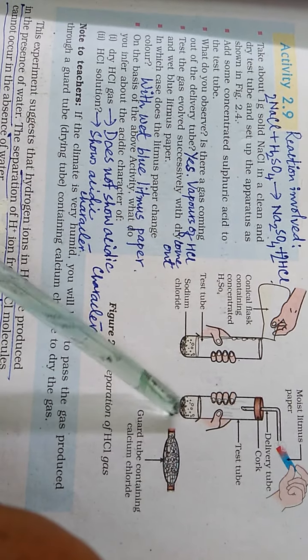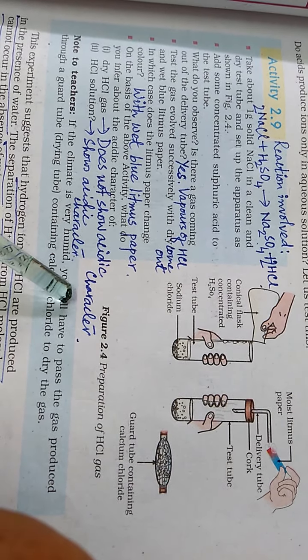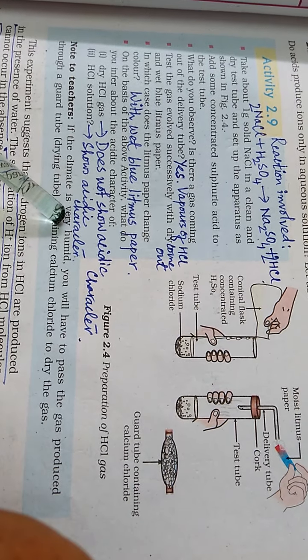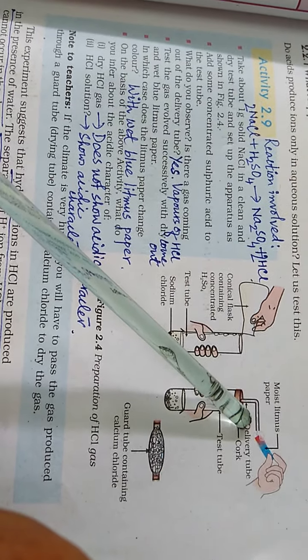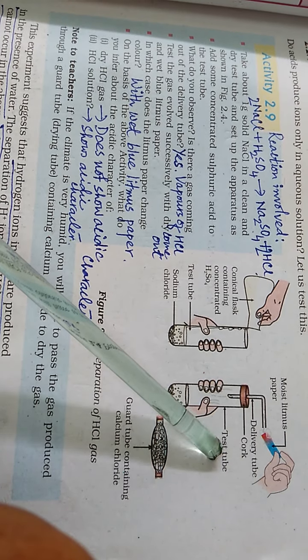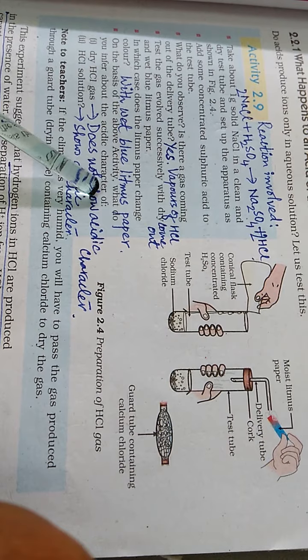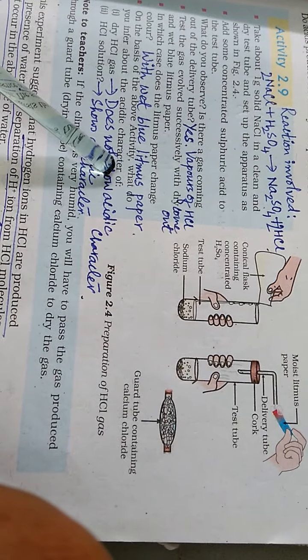We pass these vapors of hydrochloric acid through the delivery tube and bring dry blue litmus paper near the open end of the delivery tube. We do not observe any color change. Again, we bring a wet blue litmus paper near to the open end of the delivery tube. On doing so, we observe that HCl vapors turn the wet blue litmus red. This shows that dry HCl gas does not show acidic properties, whereas HCl solution shows acidic properties by turning blue litmus paper red. We can explain our observation like this.